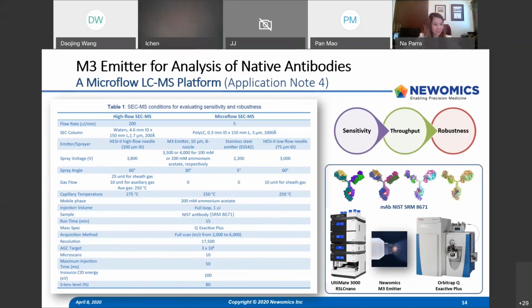I hope this answers your question. Essentially it depends on the mass spectrometer, QE Plus, HF or Lumos and UHMR, or if you use a Q-TOF instrument, maybe that's a different story. But in our hands for the QE Plus, my understanding is typically a couple of weeks to a month, depending on the injection amount of the IgG antibody, if you do native MS. Also depending on the salt concentration. If you run really high salt, I think 200 millimolar is already really high while maintaining most of the native state.